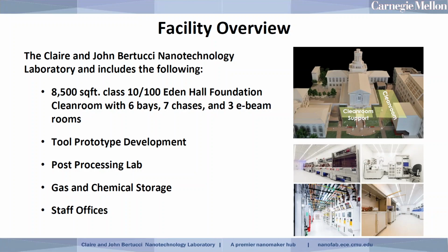The cleanroom itself consists of 8,500 square feet of clean space, and it's a bay and chase design that includes 3 separate e-beam rooms. As I mentioned, we have a few labs located outside of the cleanroom, including space for prototyping, post-processing, such as dicing. We have plenty of storage space for gases and chemicals, as well as spare parts. And staff offices are included in the facility as well.